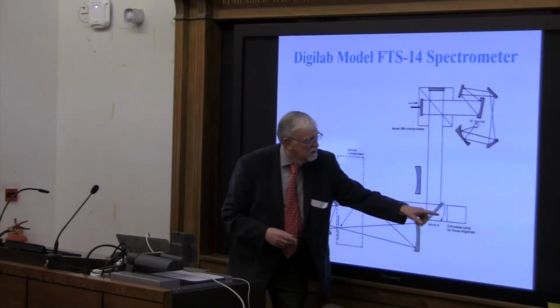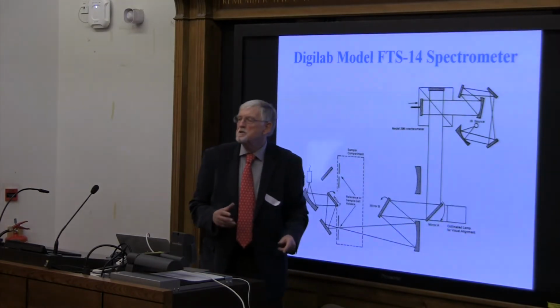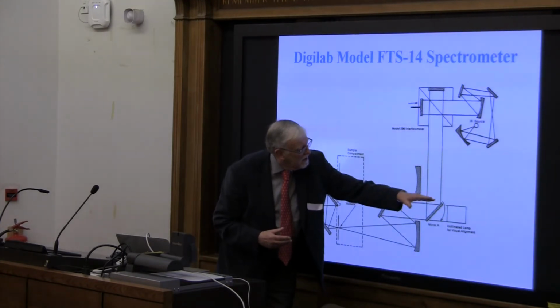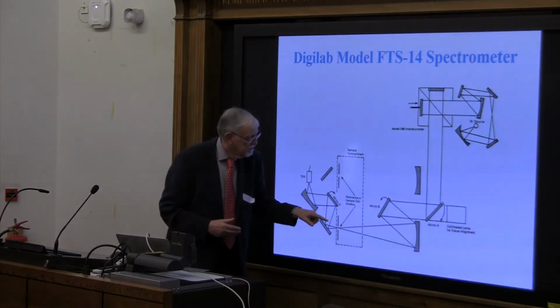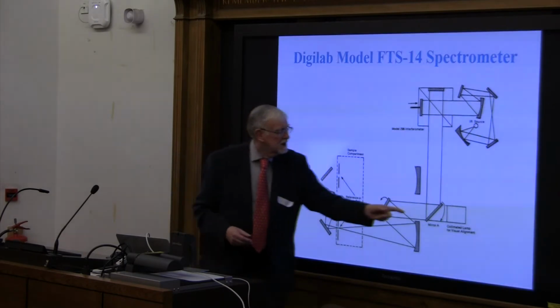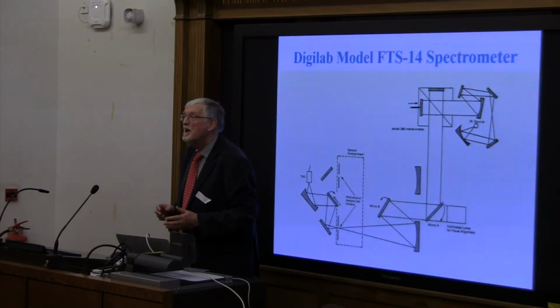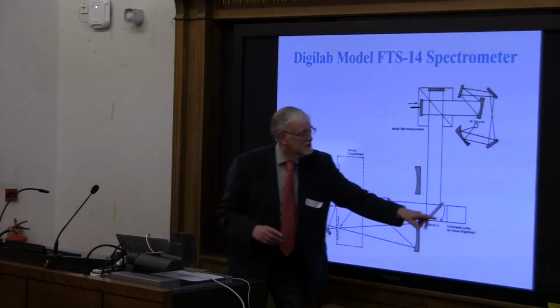There was a gun sight collimator right here, where because this was a germanium beam splitter that was invisible to the eye, you could flip this mirror out from its 45-degree position here, and this beam replicated this beam right here. So there was a focus at this point, and you could align accessories with that. This was actually a $10 World War II gun sight collimator from Abrams Optical, and when they ran out, there was nothing like it on the market. So in the end, they got rid of this component right here.